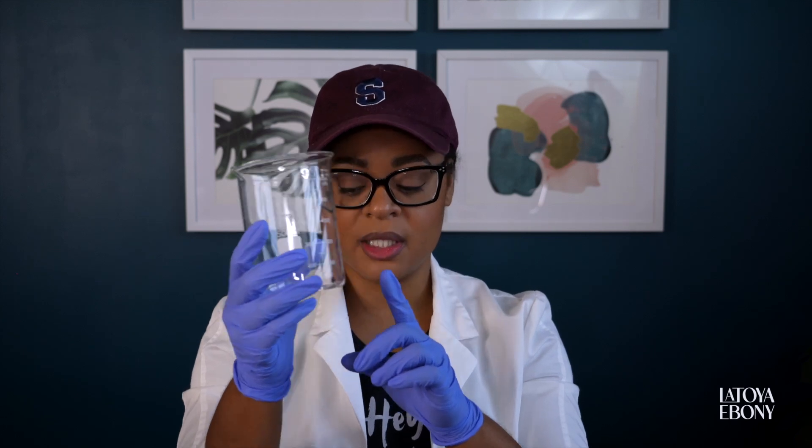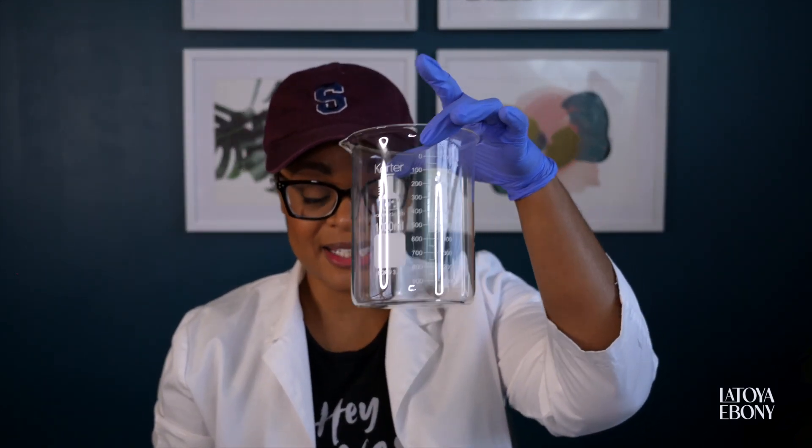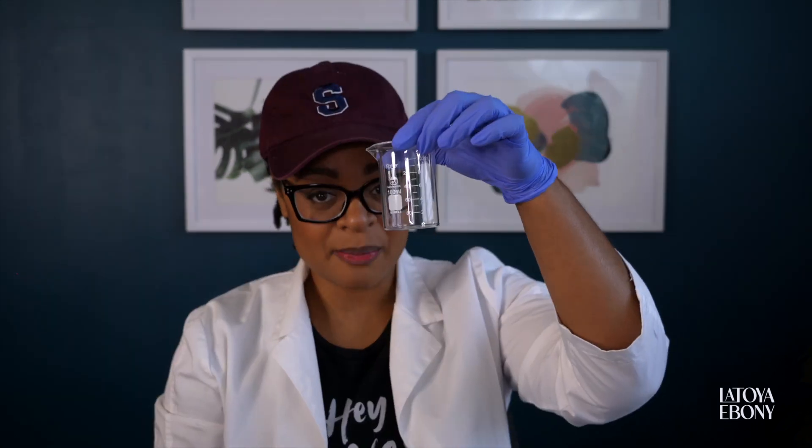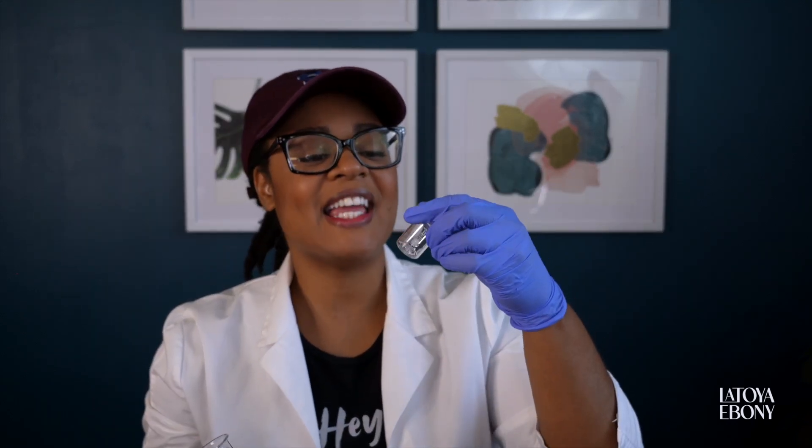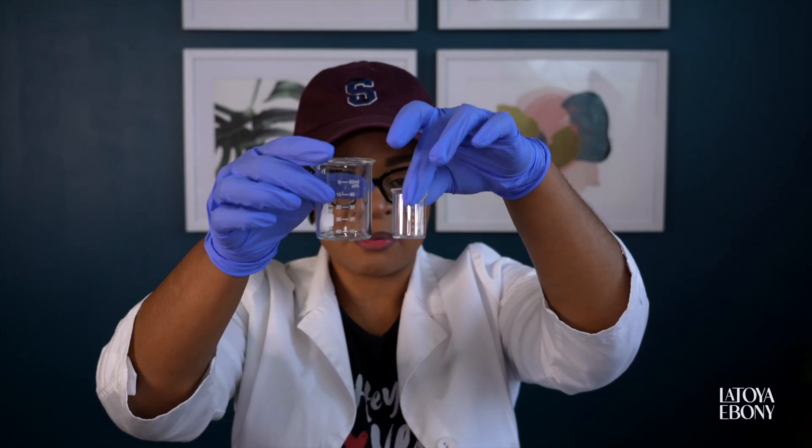This is borosilicate glass, which is a heat-resistant glass made for a lab. We have a 500 milliliter, a 1,000 milliliter, a 250 milliliter, a 100 milliliter, and then a 50 milliliter versus the hundred — you can see the difference. And then we even have a tiny 10 milliliter. It's so important to have beakers of all sizes, especially if you're doing smaller batches, still learning, still experimenting — even if you're advanced and want the right kind of glass.